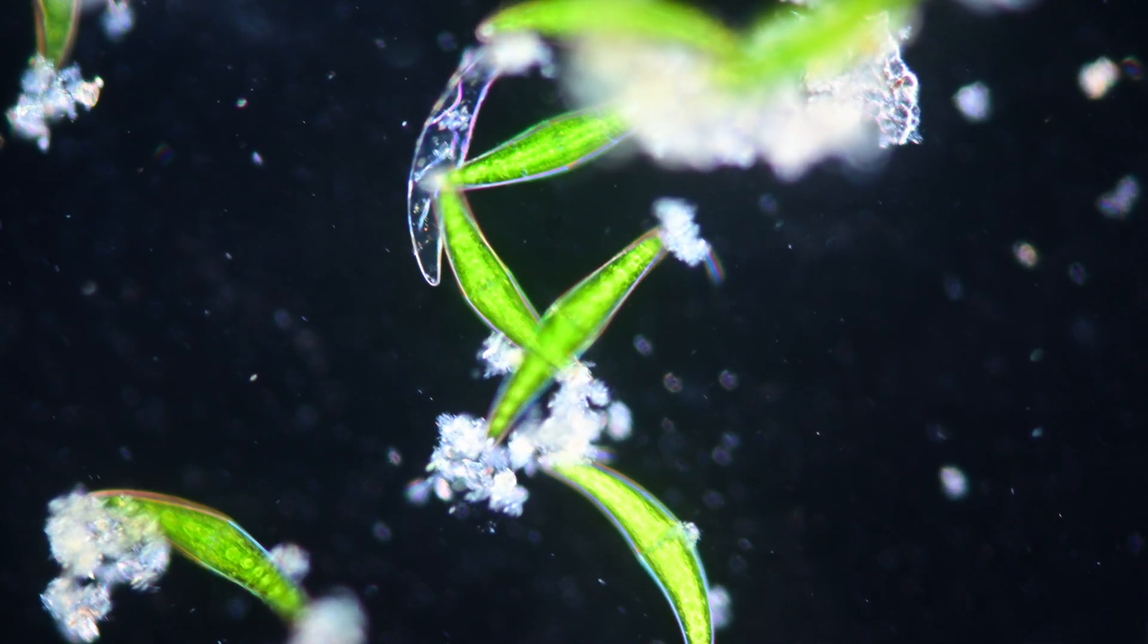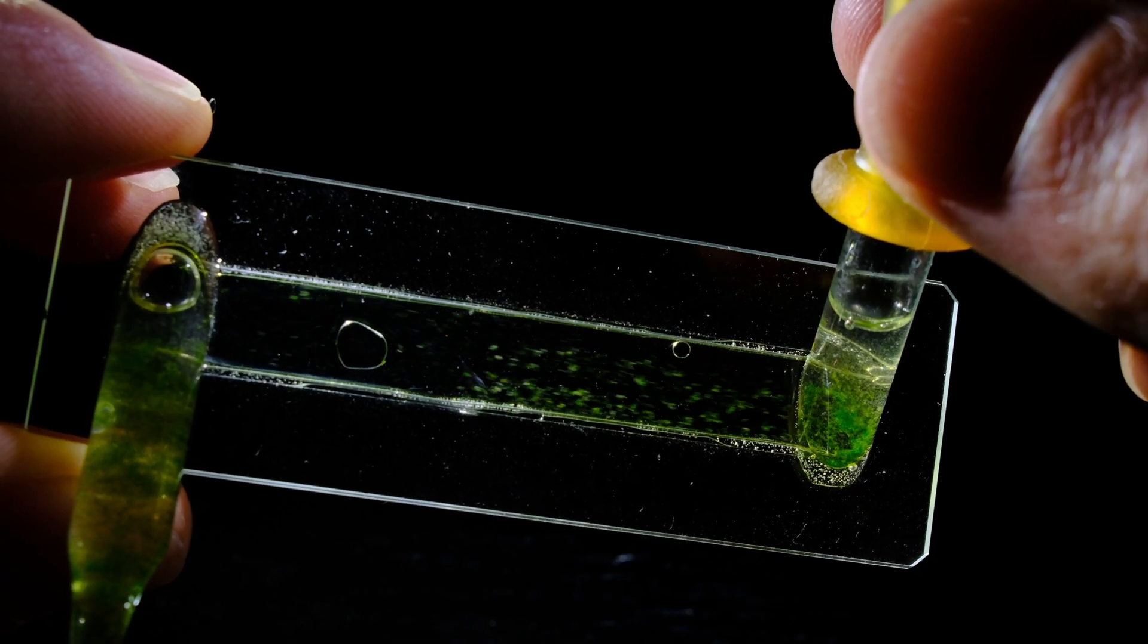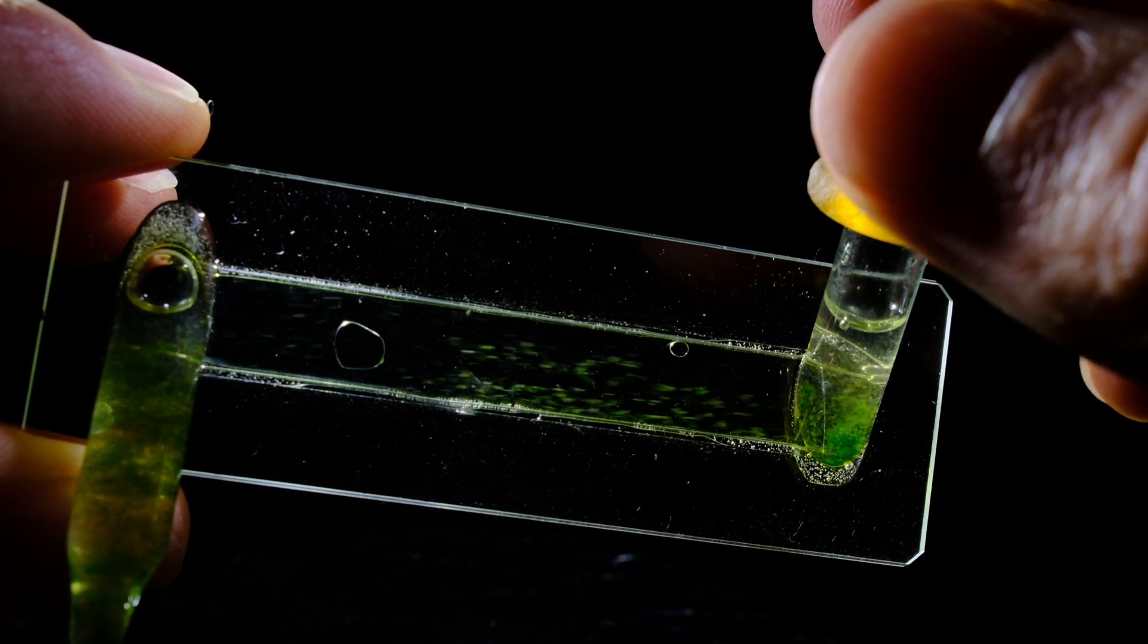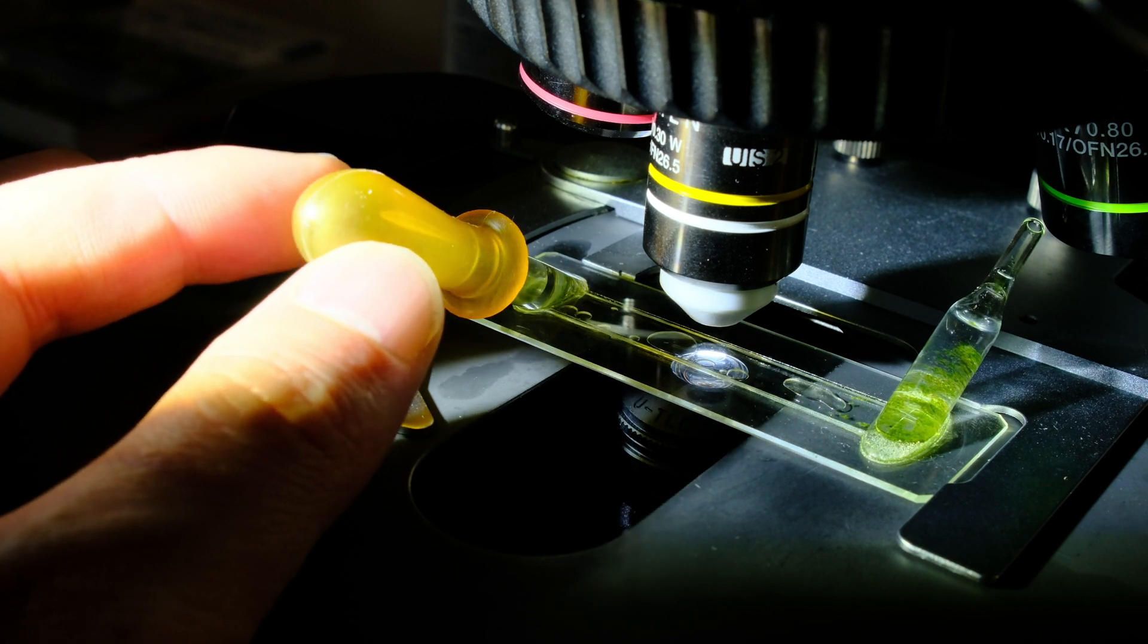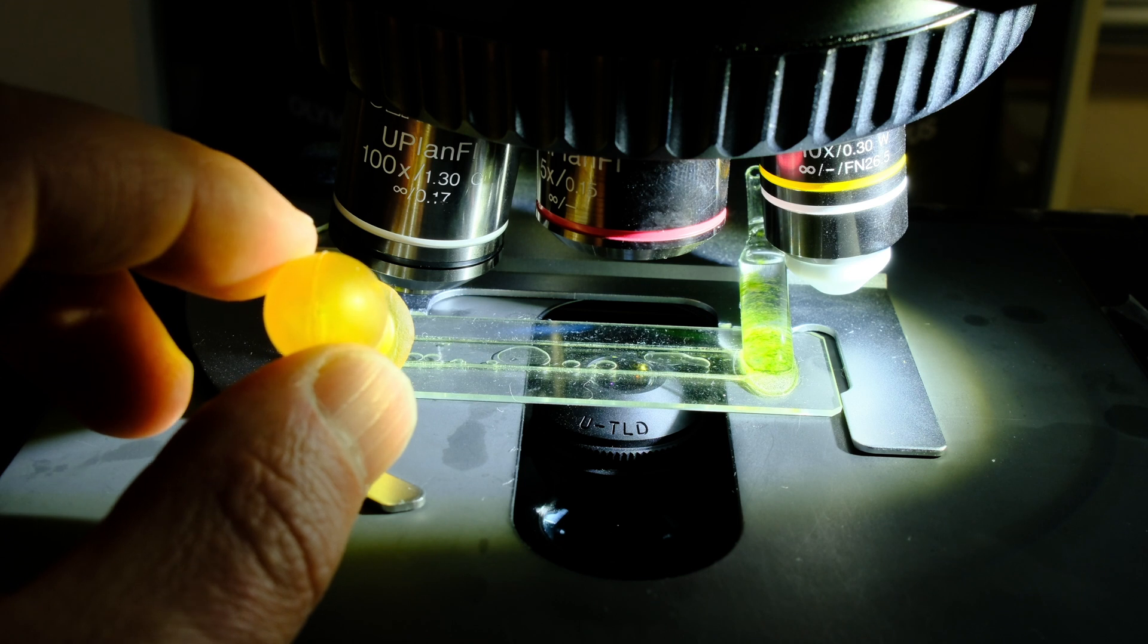Its most interesting aspect is actually that you can displace or move objects within the internal chamber. When you softly squeeze the rubber cap, you can move the liquid and move or flip objects. That can be quite useful in many instances.